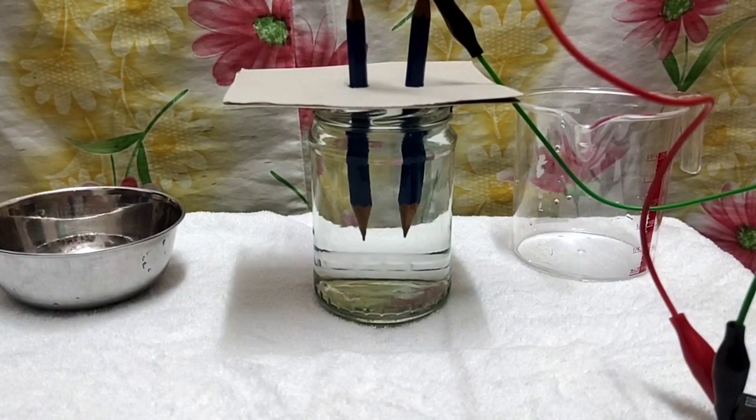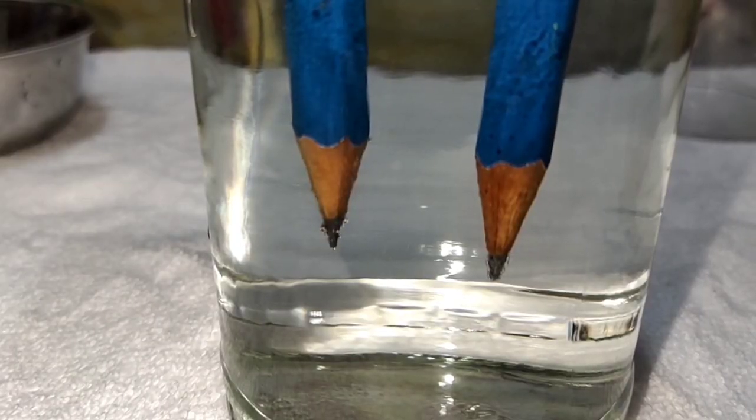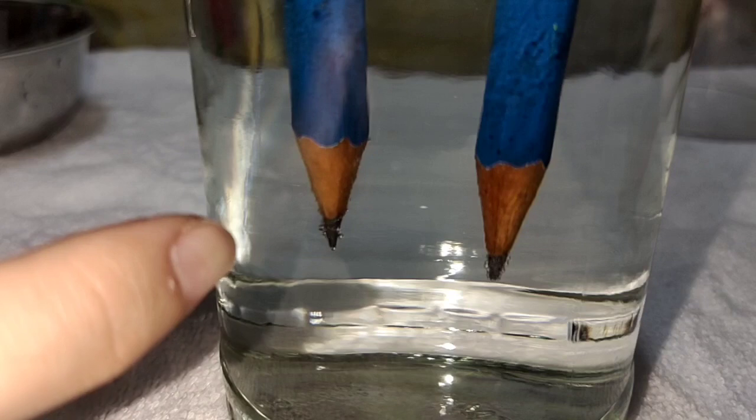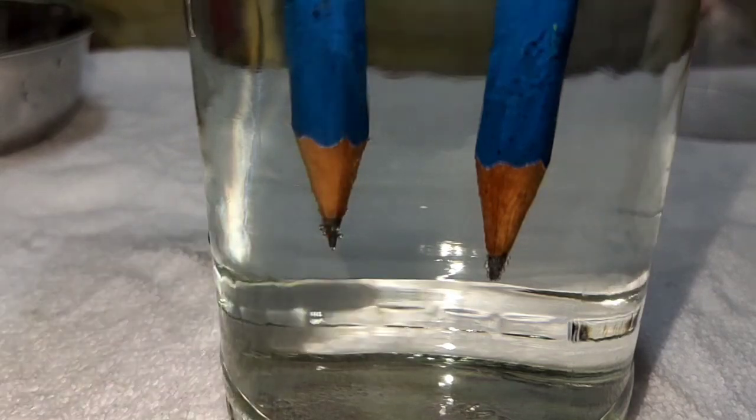So we'll observe it for 5 minutes. After observing for 5 minutes, we notice that air bubbles appear at both pencil tips, and the air bubbles at the cathode, where the hydrogen ions are present, are more than at the anode side, which is the oxygen side. This is because water is H2O, which means that the hydrogen is more than the oxygen. So we notice that the air bubbles at the cathode are more than the air bubbles at the anode.